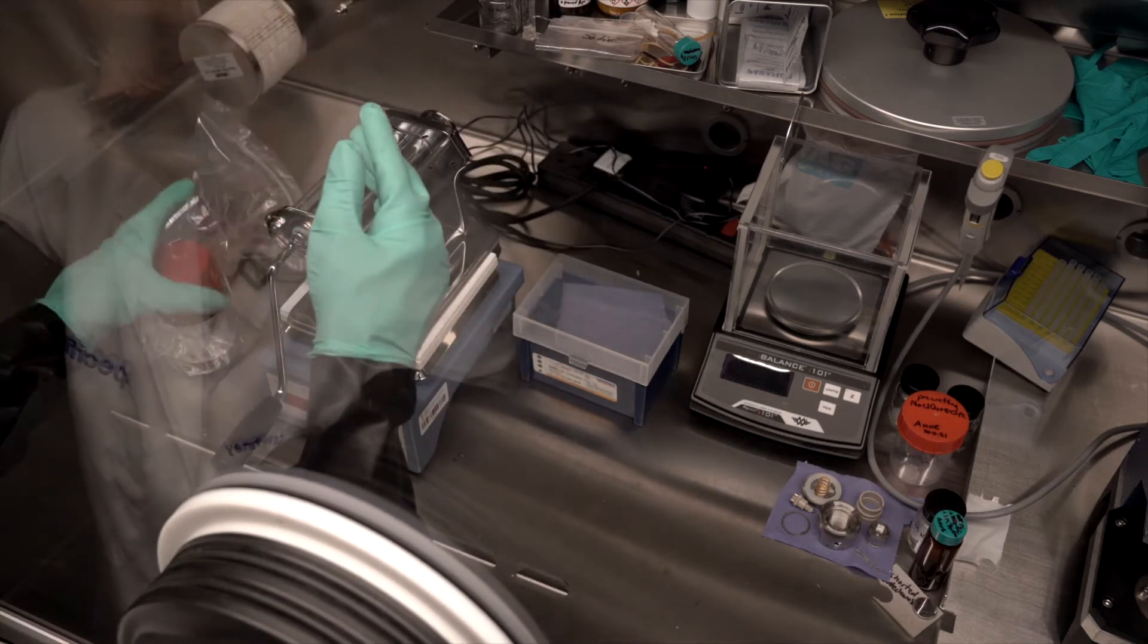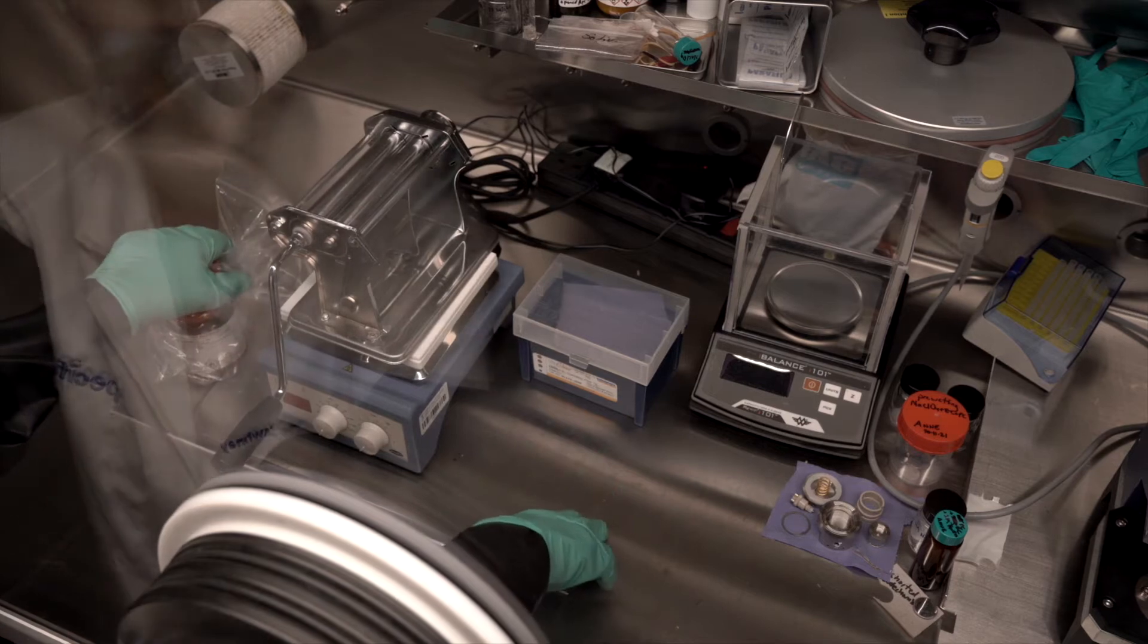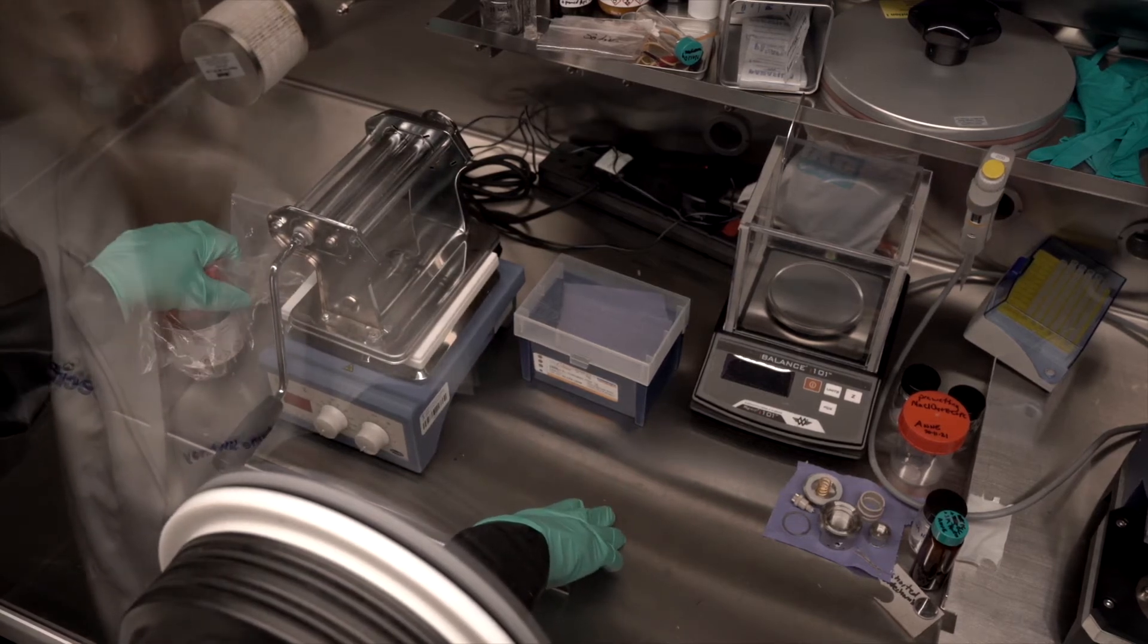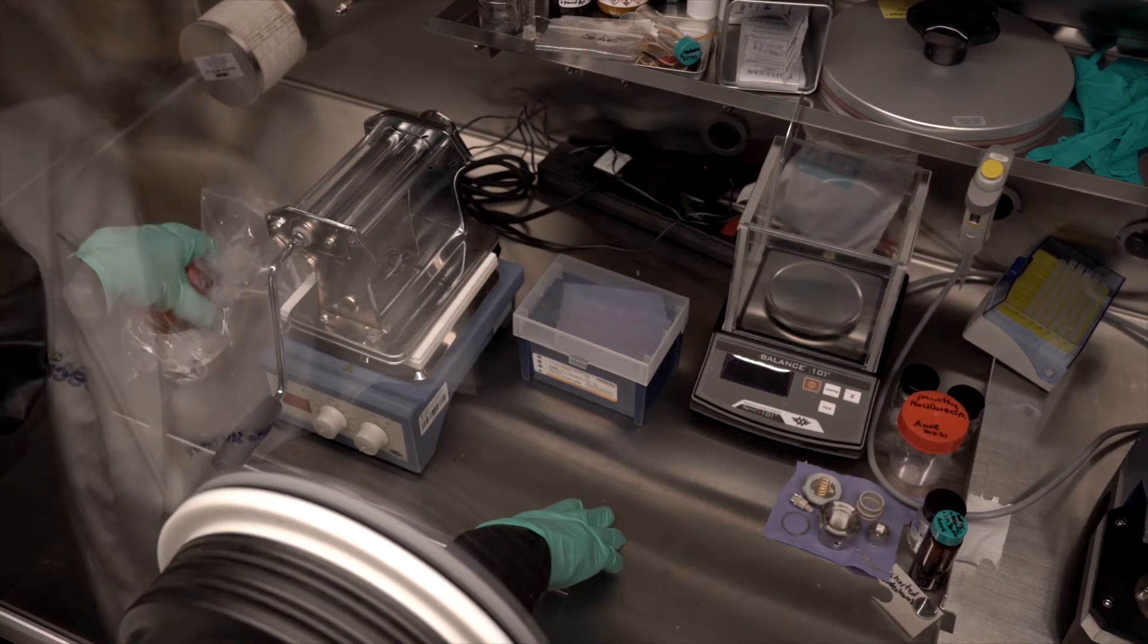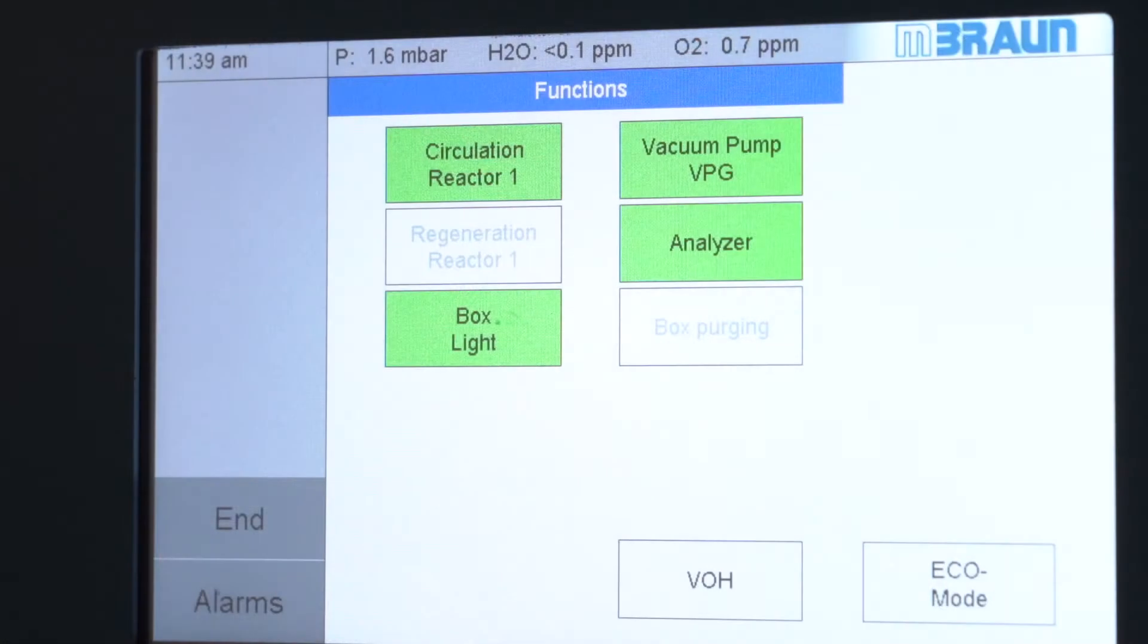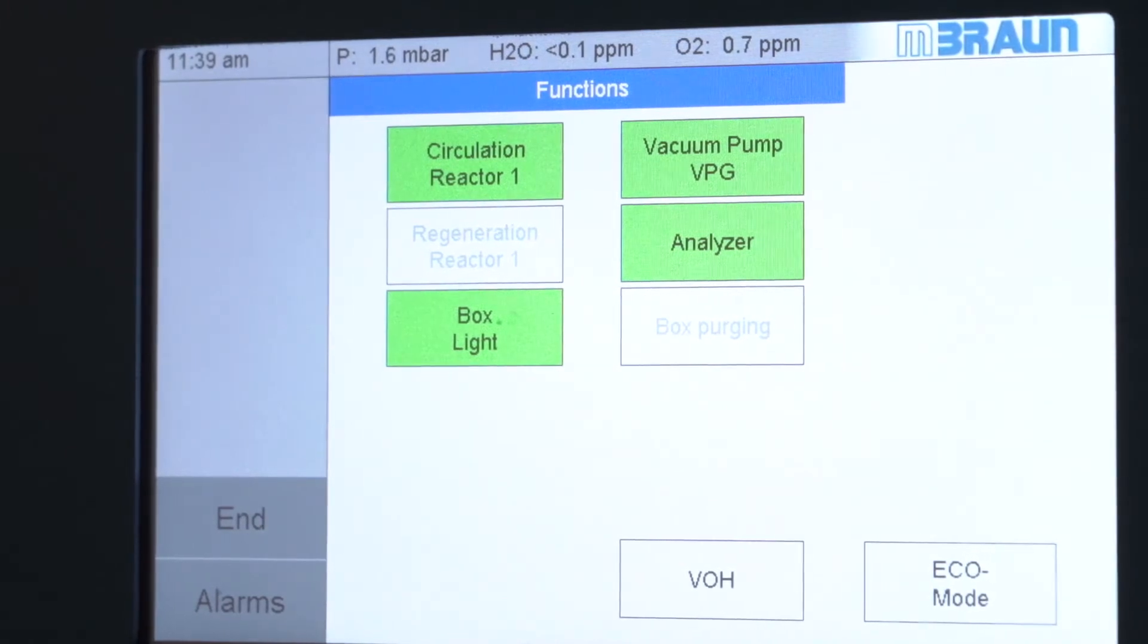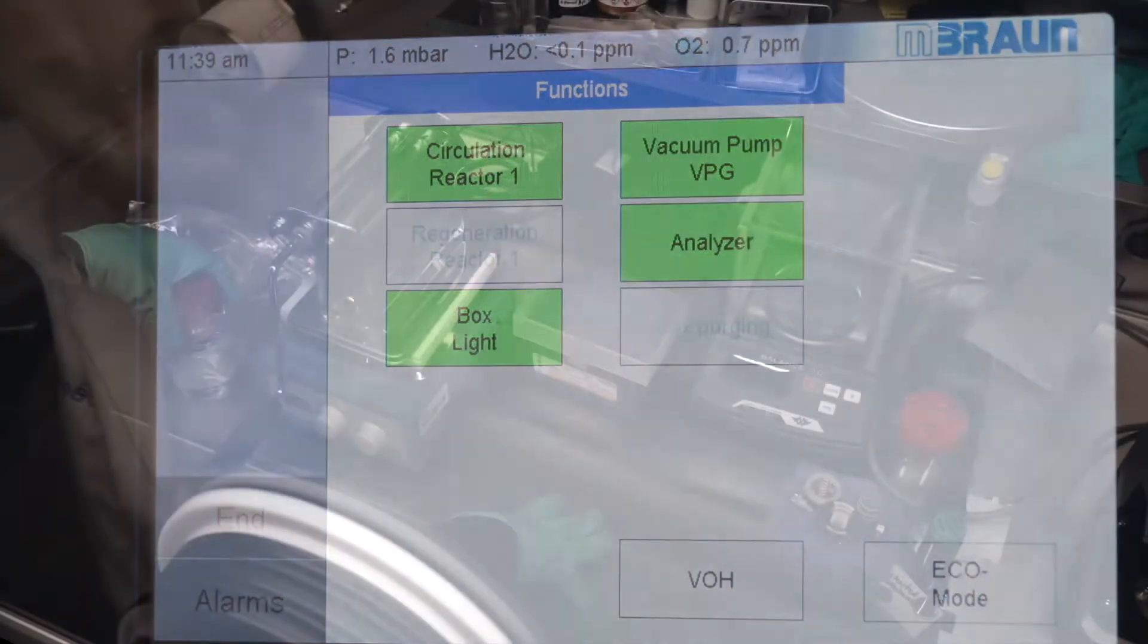Now, it probably shouldn't need to be said but before you start, it is essential that you check your water vapor in your glove box. I always make sure mine is below 0.5 ppm because naturally any water will react violently with sodium and it will ruin your day. So, make sure before you start your water vapor in your glove box is well under control for safety reasons.